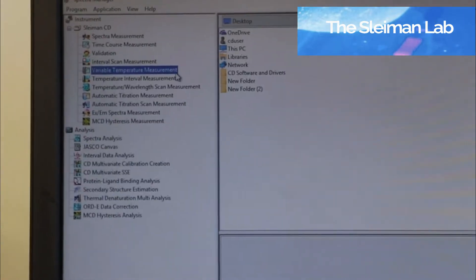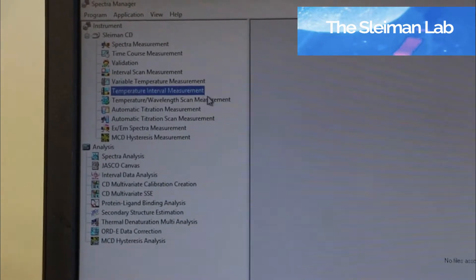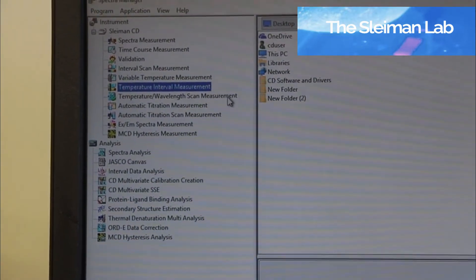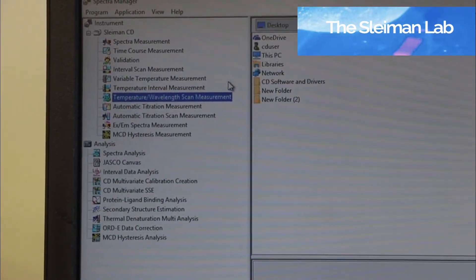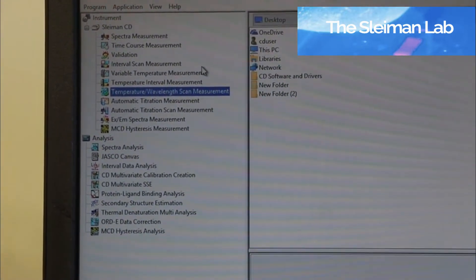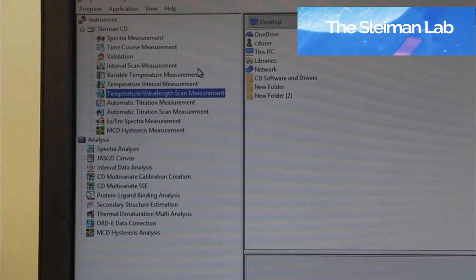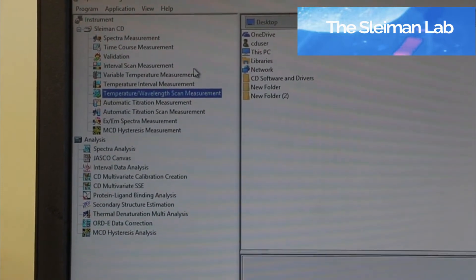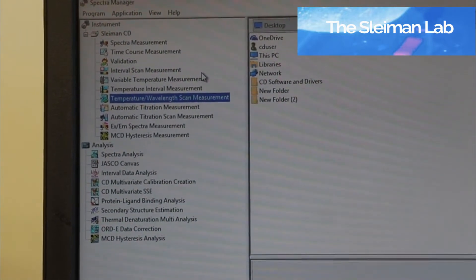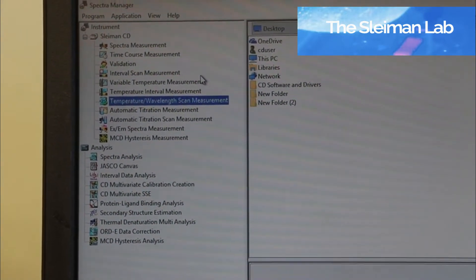Variable temperature measurements, temperature interval measurements, and temperature wavelength scan measurements are temperature-based experiments if you'd like to do a melting curve.